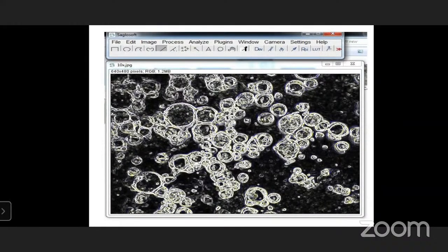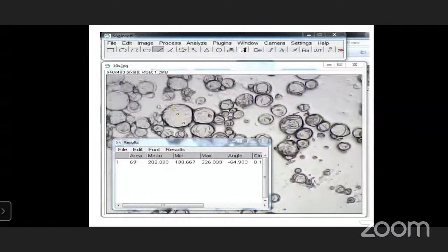So that ornamental structures one can find easily by using this dark field. Here the cell is converted into glowing cells and the background is converted into the dark. Hence it is called as a dark field. याच्यामध्ये तुम्ही बघू शकता की प्रिव्हियस स्लाइड्स मध्ये जे छोटे पार्टिकल्स जे कळत न कळत दिसतात, इकडे उजव्या साईडला खालच्या बाजूला तुम्ही बघू शकता की असे काही छोटे पार्टिकल्स आहेत की ज्याचा साईज 1 मायक्रॉनच्या आसपास आहे.